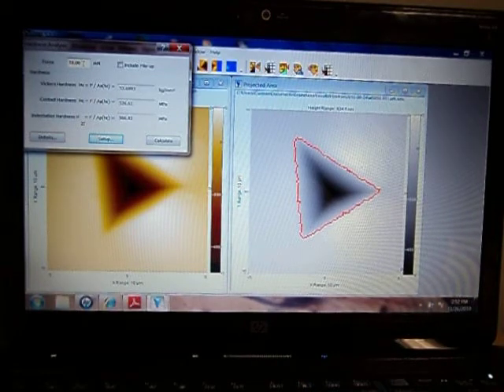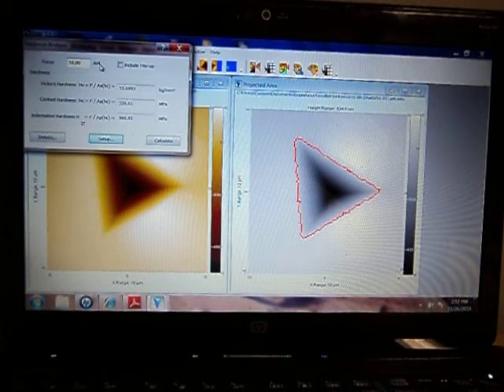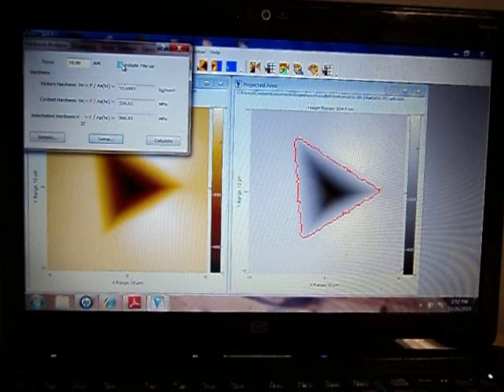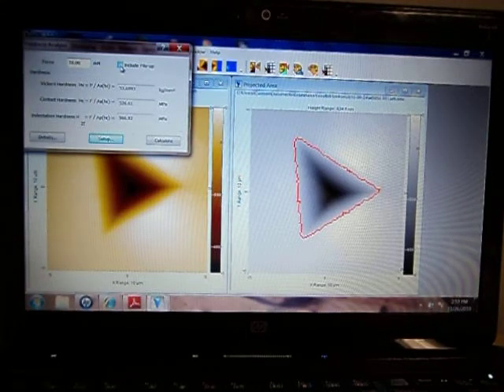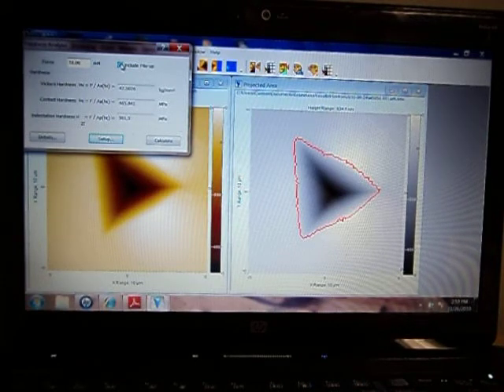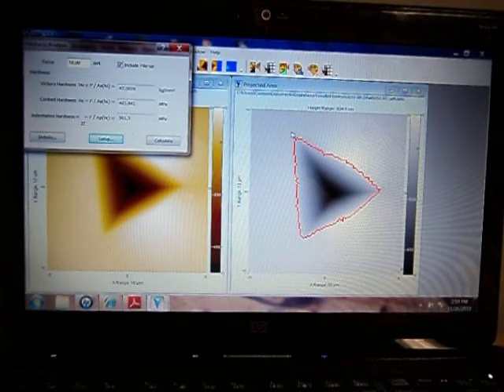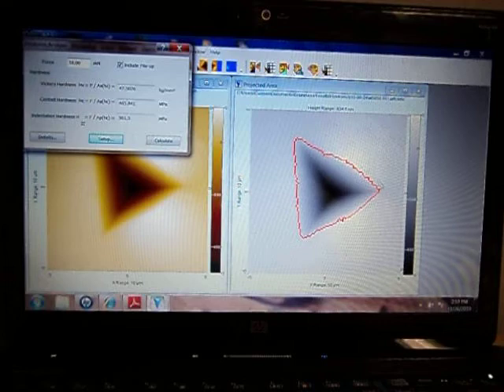The first item it asks for is what force was used to make the indent, in this case 10 mN. If you want to include the pileup, click on Include Pileup, and it changes the outline. Now it shows where the indenter made contact with the sample, including the pileup area.